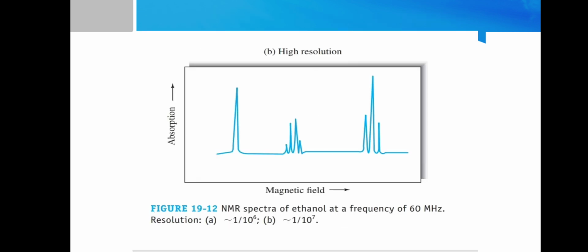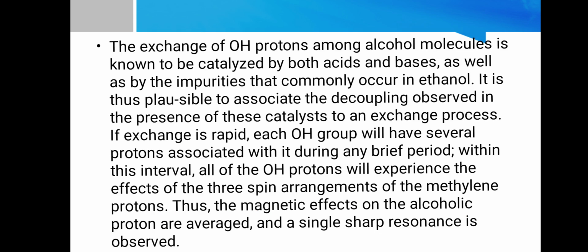So this is the spectrum which we are talking about, the NMR spectrum of ethanol, which we also saw previously. The exchange of OH protons among the alcohol molecules is known to be catalyzed by both acids and bases, as well as by the impurities that commonly occur in ethanol. It is thus plausible to associate the decoupling observed in the presence of these catalysts with an exchange process.